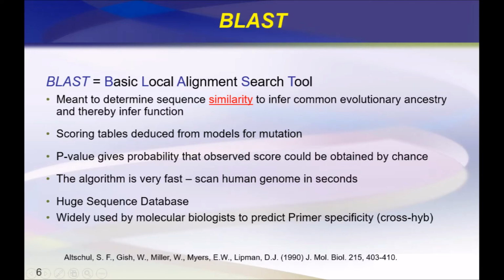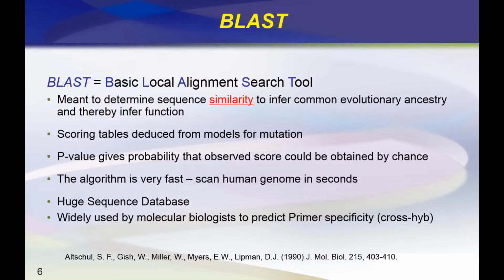BLAST is widely used by molecular biologists to align query sequences against a vast database of genome sequences to reveal sequences that are the most similar to the query, which enables researchers to infer biological function for a query whose function is unknown. For that, BLAST is truly outstanding. And it's widely used by molecular biologists to predict primer specificity. And it's this last point that we want to talk about a little bit.